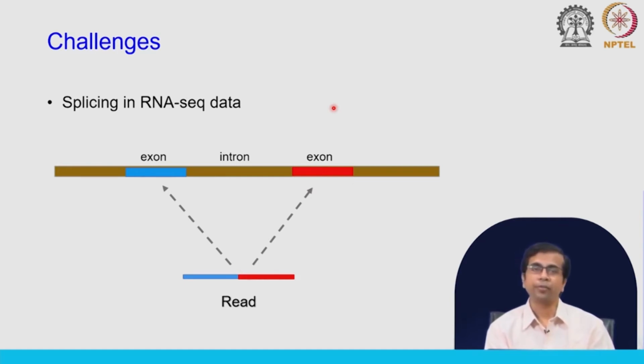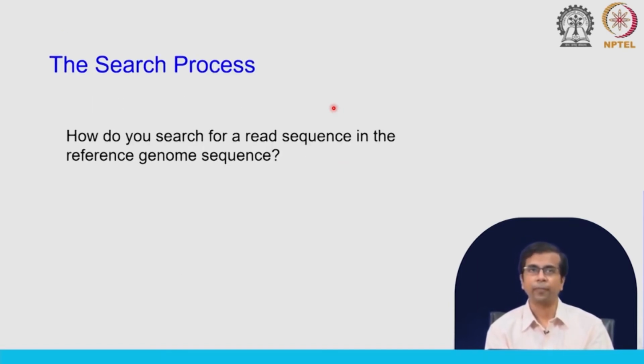We are working with big genomes, we have a huge amount of data, and on top of that we are not working with ideal data. So, we have sequencing errors, we have repeat sequences, etc. So, to make our life more difficult.